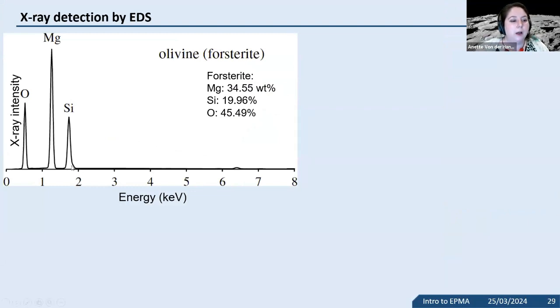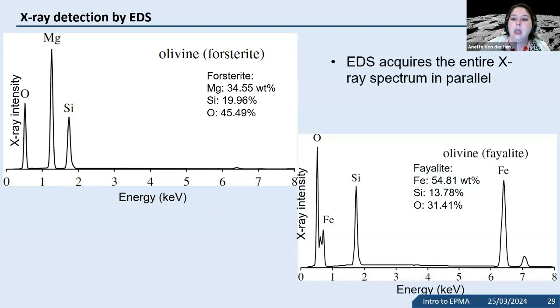Again, we will have peaks at certain parts in the X-ray spectrum that are characteristic of the element, and their absolute abundance is on first approximation representative of the abundance of those elements. And so we can get a rough idea of the composition of a material. It's especially useful if we have just an unknown material, and we even need to know what kind of elements we will find.